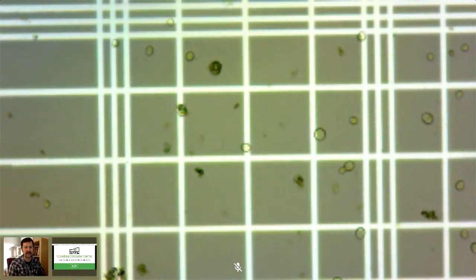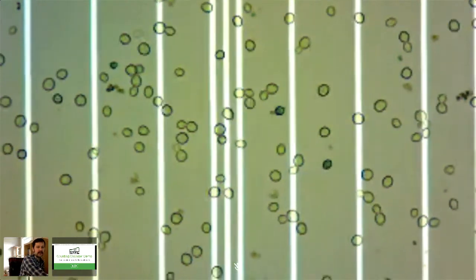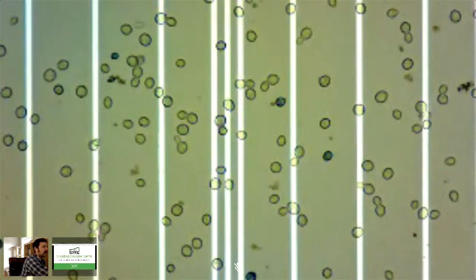At a normal 40x or 400x, it would be zoomed out a bit further, so you could actually see all the edges of this counting area. And then I'll just move over to the Cali. So this is what it would look like counting Cali. That's really funny. There was some extra methylene blue on my counting chamber. That's why these cells are picking it up. These yeast haven't actually been treated with anything. So always make sure that you clean your counting chamber really well, so you don't get stain pickup on your yeast. So this is what your yeast will look like underneath the scope.